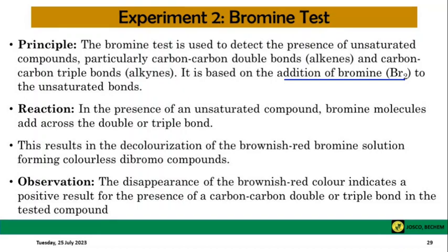The bromine is going to break the double or the triple bonds, with the bromine bonding to the carbons.